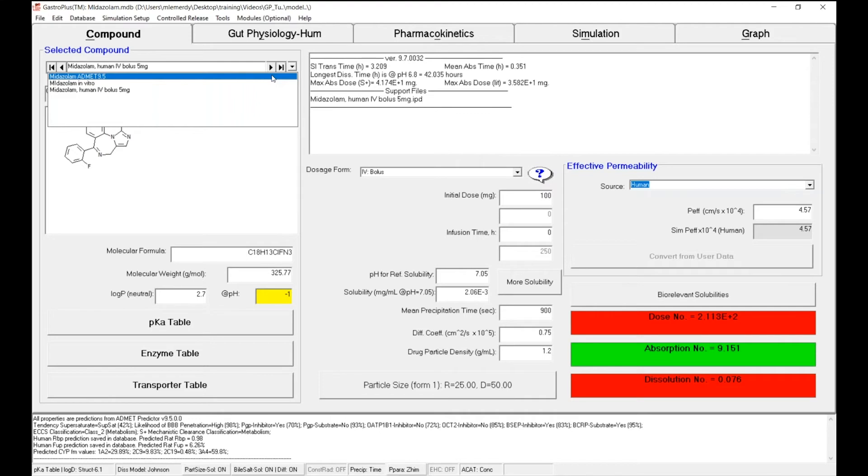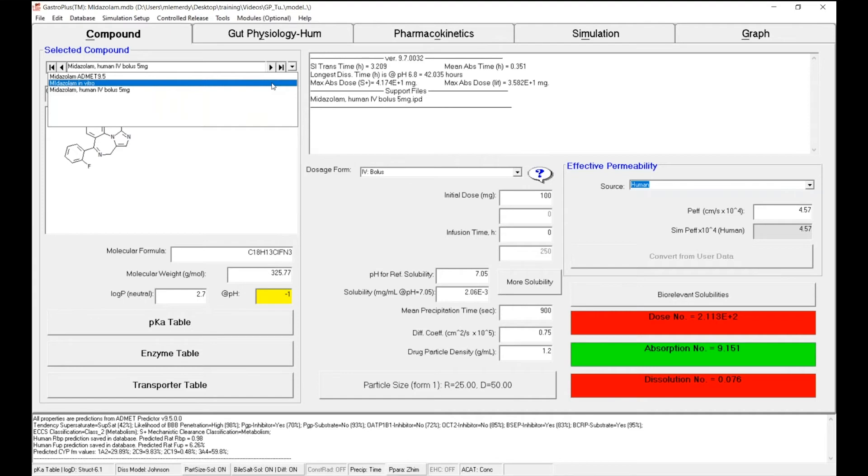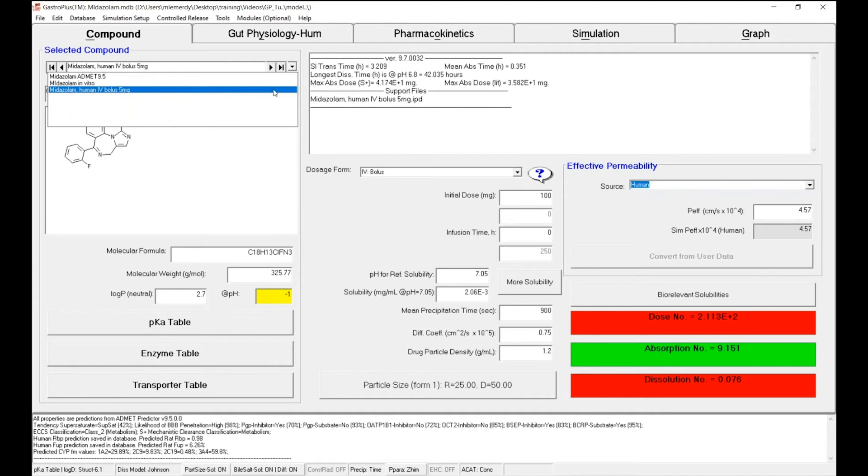Then in the second record, we entered the in vitro measured physichem properties such as the logP or the pKa. And finally, in the third record, we first entered the observed IV data and then set the compartmental PK model to describe those data. In the end, we were successful. The aim of the second phase of this tutorial is this time to predict the oral administration of midazolam using a PBPK model.